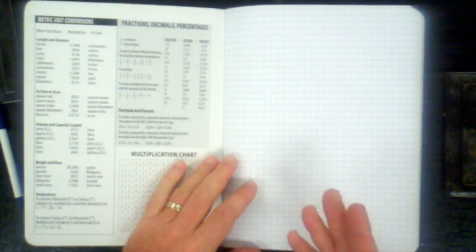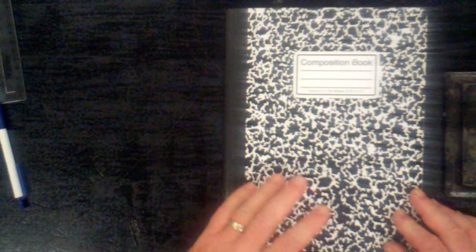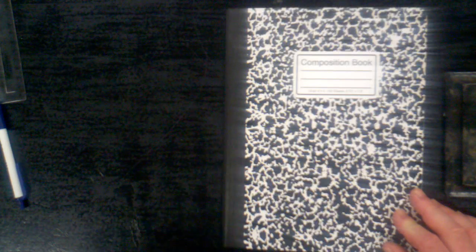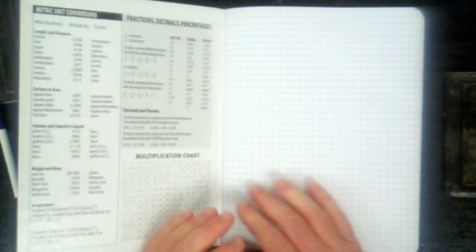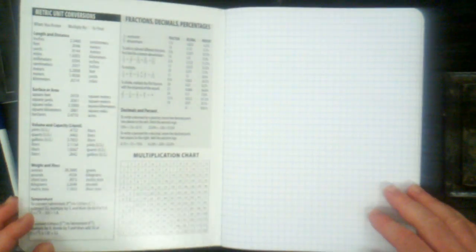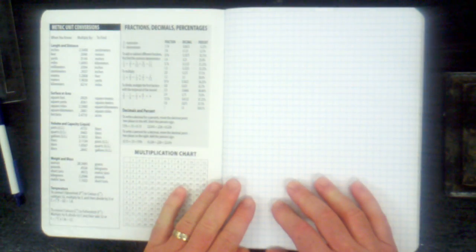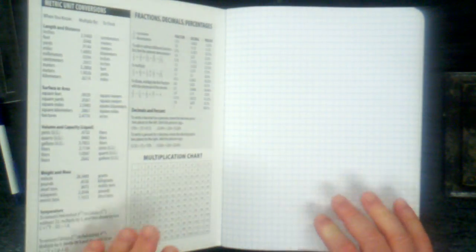It keeps you from putting in pages, and it keeps you from taking them out, which is important for trying to get your ideas patented, because you have to show what you did and when you did it in order to actually get credit for a patent for an idea that you might have. Otherwise, you could come up with the same idea and pretend that you had a notebook that had certain pages in that showed the idea just by adding them in ahead of time. But a bound notebook like this prevents this from happening.